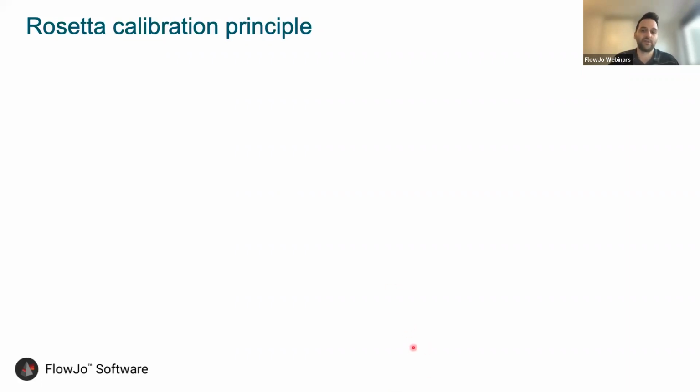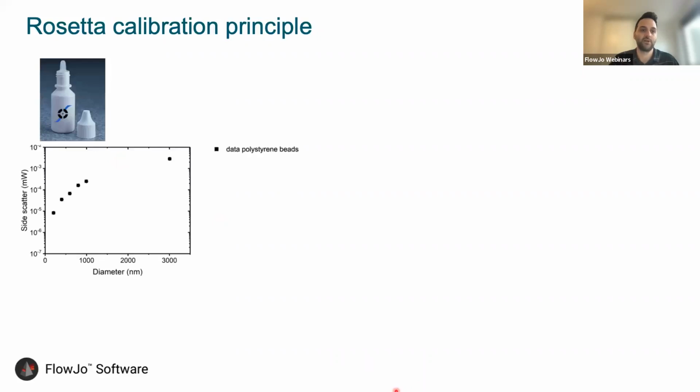That is supported by the software, we can then execute the platform on the controlled bead FCS sample. And what we're going to be getting in that case is the FCS file that we loaded on the software, and we have measurements, which here you see the data points of known diameter beads and the relationship with the light scatter intensities. So this is what we have known.